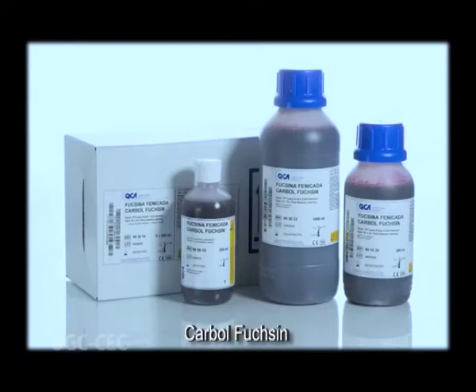Now, in acid-fast staining, generally we use carbol fuchsin. Now, carbol fuchsin is made soluble in 5% phenol. The reason behind this is that carbol fuchsin is insoluble in water or alcohol. Generally, the cell walls of Mycobacterium contain a lipid which is known as mycolic acids. The presence of mycolic acids in these Mycobacterium makes the staining of Mycobacterium through other processes very difficult. As a result, acid-fast staining is exclusively used to identify them.